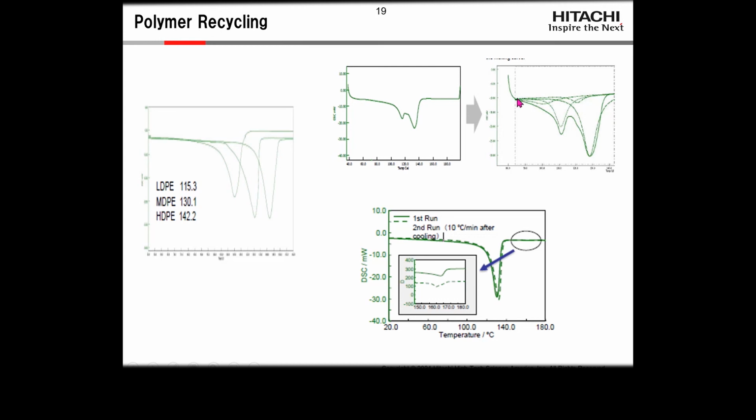If they're blended together, there are actually programs available that we have where we can separate them into peaks so that you can estimate how much is that. And then just for detection, the detection limit in IR is about 1% off of a solid pellet. In the DSC, with sensitivity, we can go to very low concentrations and pick up that these two peaks here have just a little bit of polypropylene in them, which could cause problems as you try to use the recycled material.